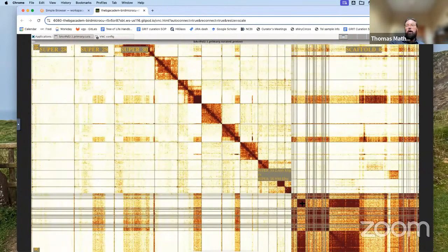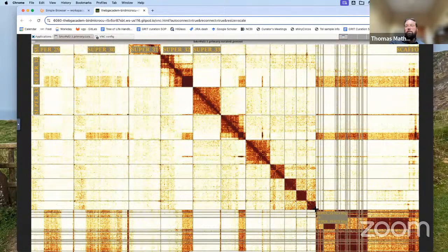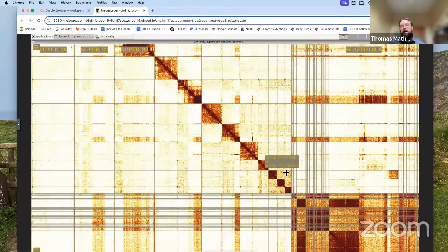And they're all quite large. So the smallest chromosome is nearly a megabase. Actually, it is 1 megabase long, I think. So they're all much bigger than what we see in these HiFi assemblies. One thing I will try, and I think is worth trying, we haven't had time to do it yet, is making a reduced map of the smallest scaffolds below 20 megabases again for this type of nanopore assembly, and then having a closer look to see if we can see any other assembly errors in these micros.